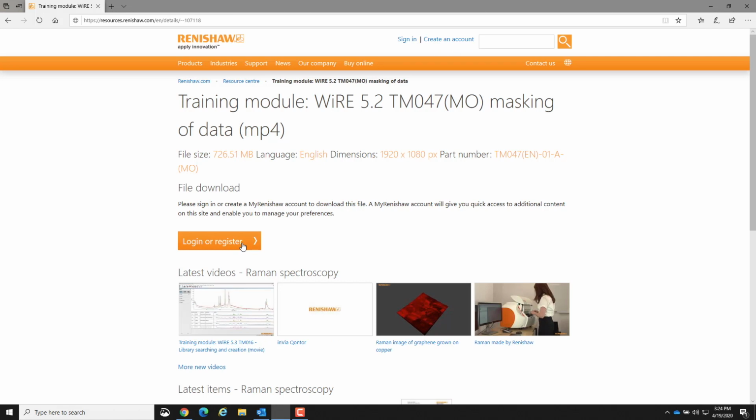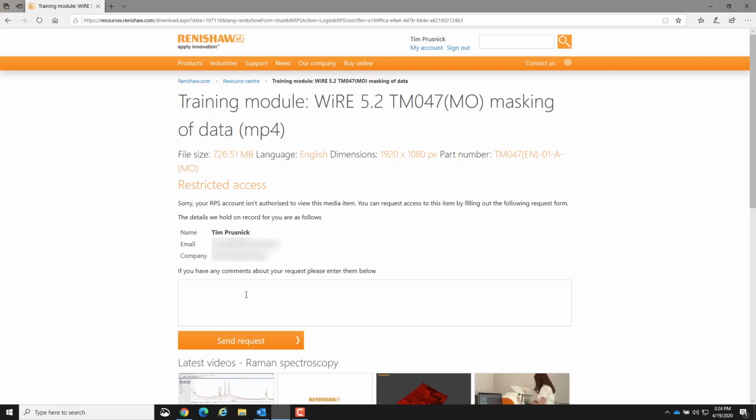If you have not already requested access to the training modules, then selecting one of the documents will prompt you to submit a request for access. We will then review your request and authorize your account.